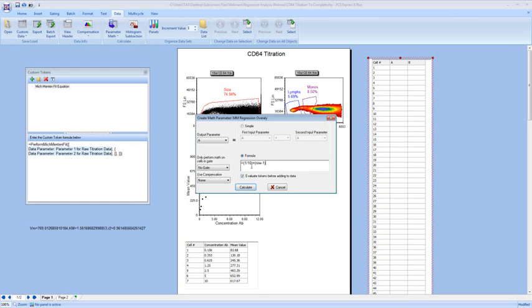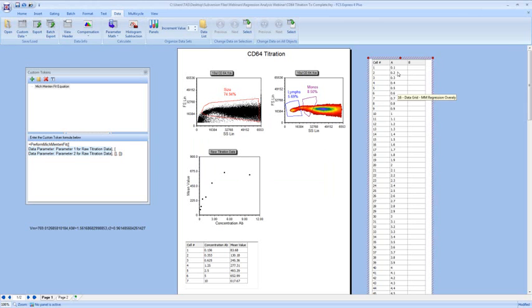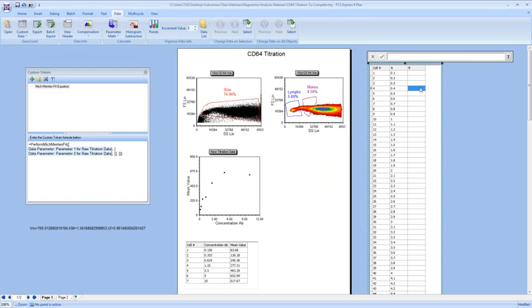And what that's going to do is look at the row before us, and then add this new value to that row. And the new value that we're going to use is 1 divided by 10 again. So pretty much what's going on here is that it starts at 0.1. For every row, add a value of 0.1 from the last row. All right, and we'll leave evaluate tokens before adding the data checked, and we hit calculate. You'll see in our custom data that we've now calculated 0.1, 0.2, and this is going to go all the way through our data list down to the end here.